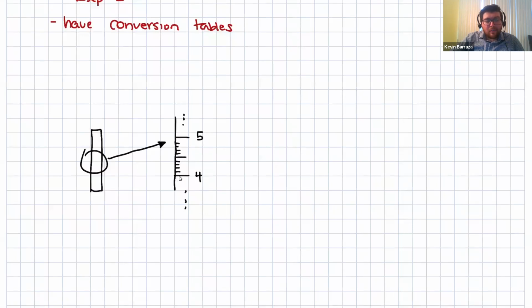graduation. So what is the smallest increment that we are counting, the smallest digits place that we're able to count using the tick marks themselves, meaning I'm just looking at the lines and I'm able to count in units of, is it 1, 2, 3? Is it 0.1, 0.2, 0.3, etc.? That's the first thing. So for this kind of ruler, which digits place are we going to be able to see with our eyes with the tick marks?